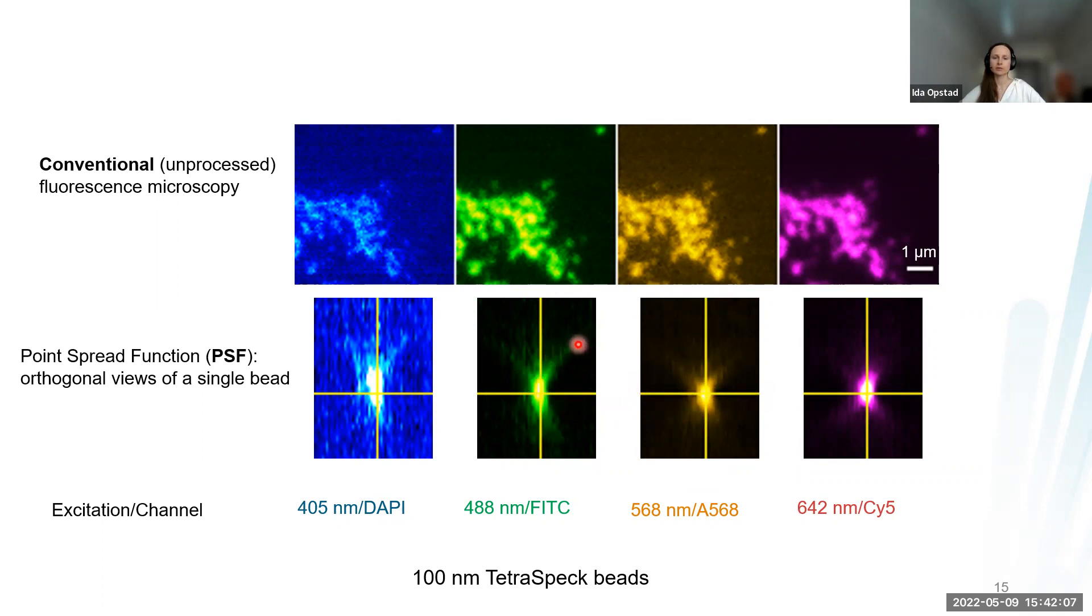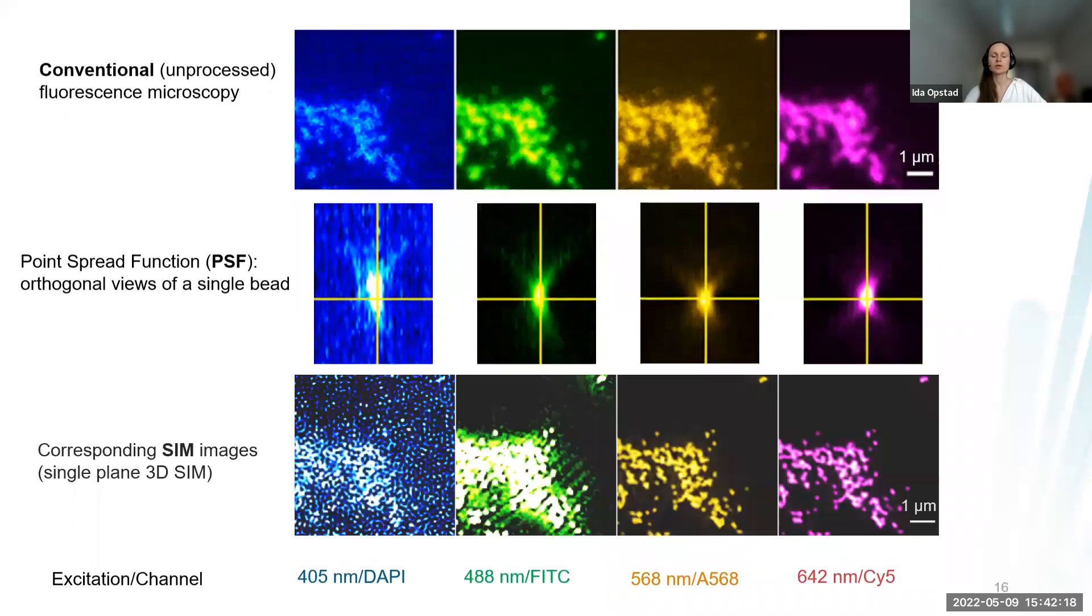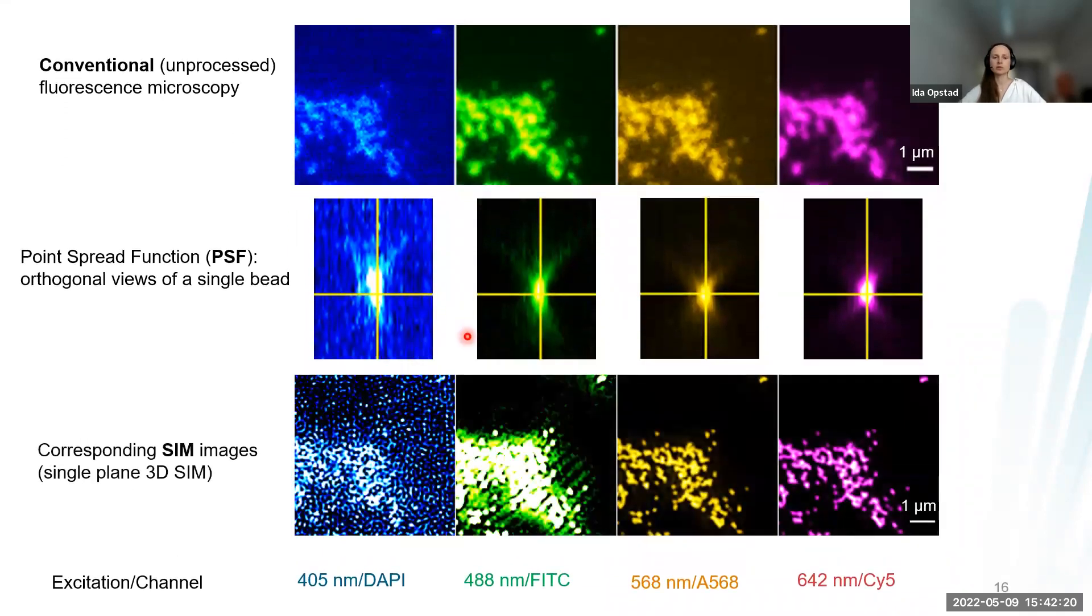This is the Z axis and this is X or Y. For green, we see it starts spreading a bit more out. For the blue channel here, it spreads even more, but also the signal to noise is really poor. What happens if you try to reconstruct something like this is we only get reconstruction artifacts. Only where the point spread function looks good will we get an actual super resolved image.